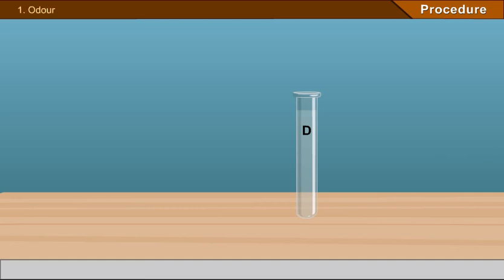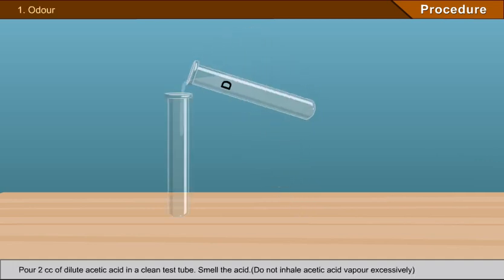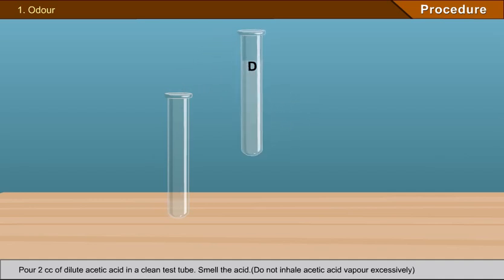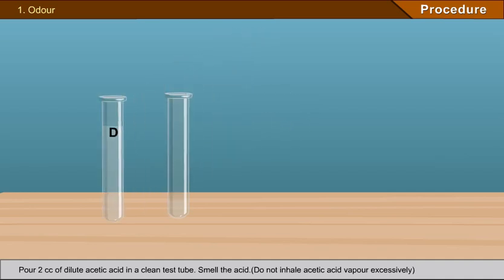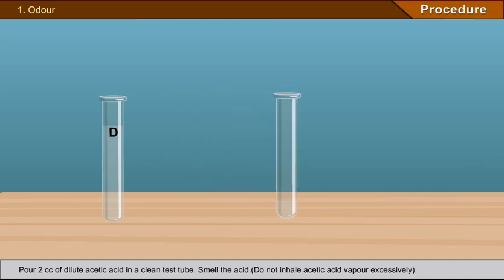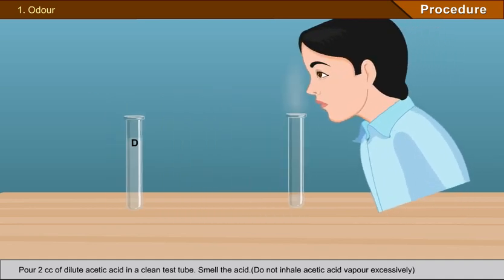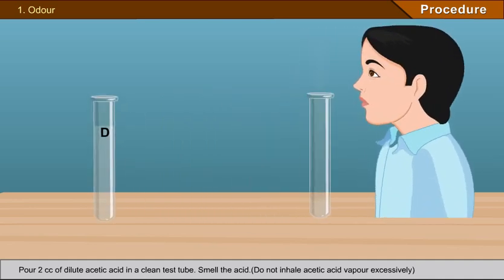Experiment 1 - Odor: Pour 2 cc of dilute acetic acid in a clean test tube and smell the acid. Do not inhale acetic acid vapour excessively. Observation: it has a peculiar pungent smell, somewhat sour in nature, like that of table vinegar.